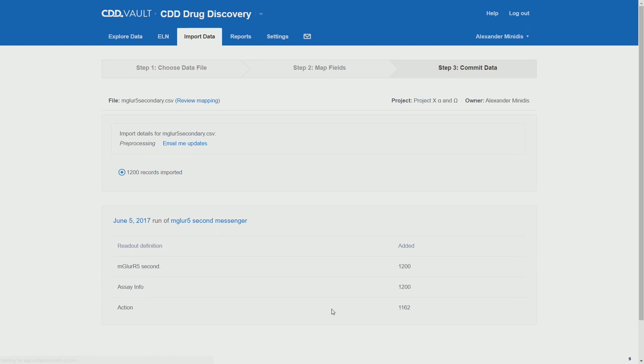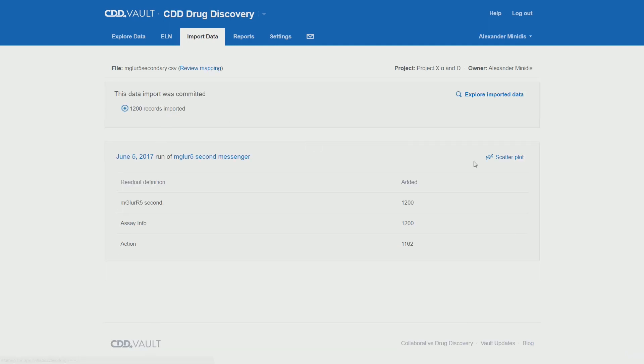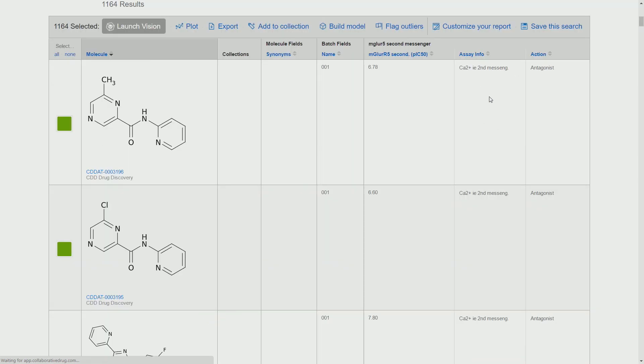By means of some video magic we accelerate the import. Once that is done, we can explore our data, for example by the scatter plot or directly the explore import data.